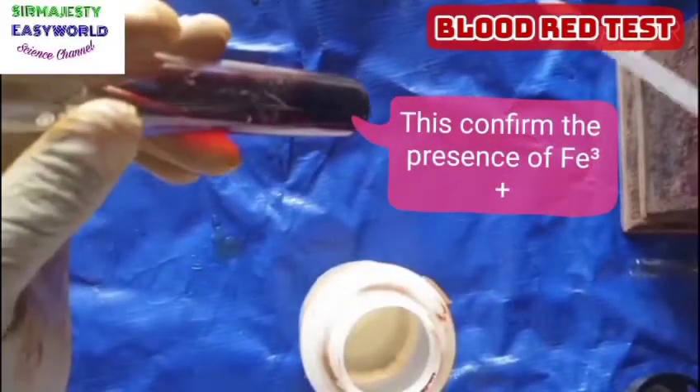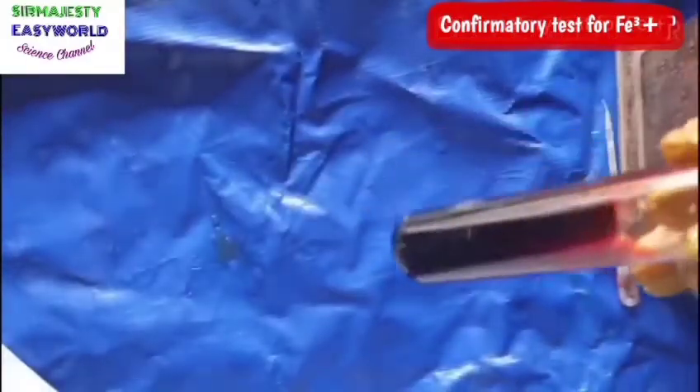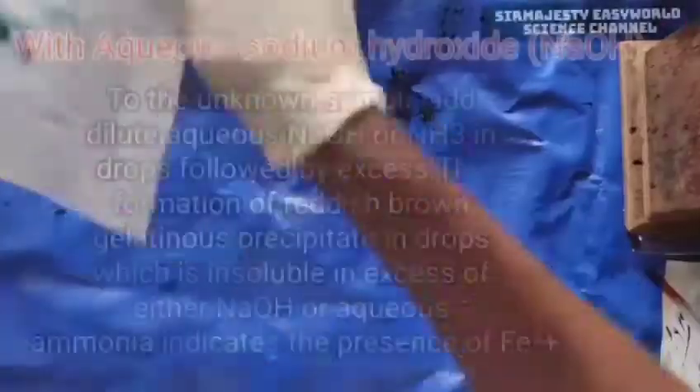Wow, see that — it gives us a reddish color, you see that? That's why we call it blood red. It is only for Fe3+ ion. Let's see the redness — oh my god!